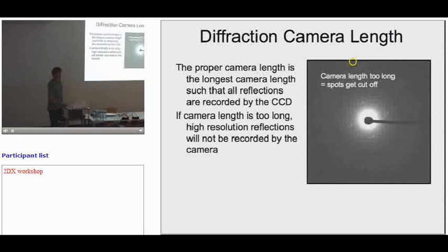The objective aperture happens to be really close to it. So if you go to diffraction mode and focus the beam to one spot while you get a good focus on the objective aperture, you end up with a parallel beam in that condition. If you have a microscope that doesn't have a nanoprobe mode, there is something similar.